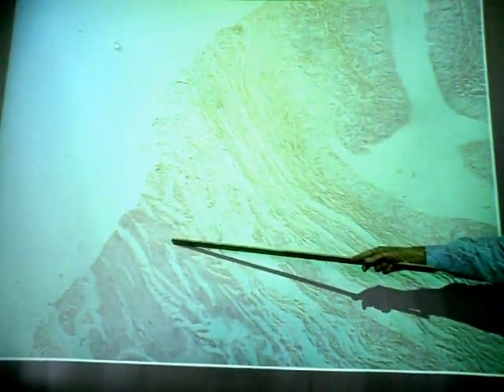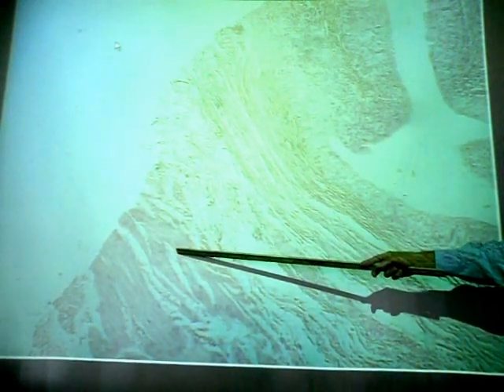And then we go into the muscle layers. Then we go to the edge of the organ here. So again, here's the epithelium, transitional epithelium. This pink stringy stuff here is the lamina propria. And here is one of the muscle layers. Again, it's smooth muscle, and again, it's longitudinal. Now, the urinary bladder wall actually has 3 layers of muscle. The inner one is longitudinal, then a middle circular layer of smooth muscle, and then an outer longitudinal layer of smooth muscle. And actually, the distal part of the ureter is the same. It has 3 layers. But it's always the inner one longitudinal, and the one outside that is circular. If there's a 3rd layer, it's outer longitudinal.